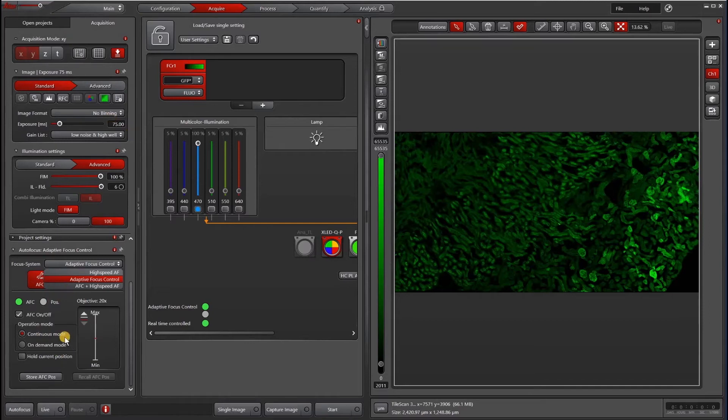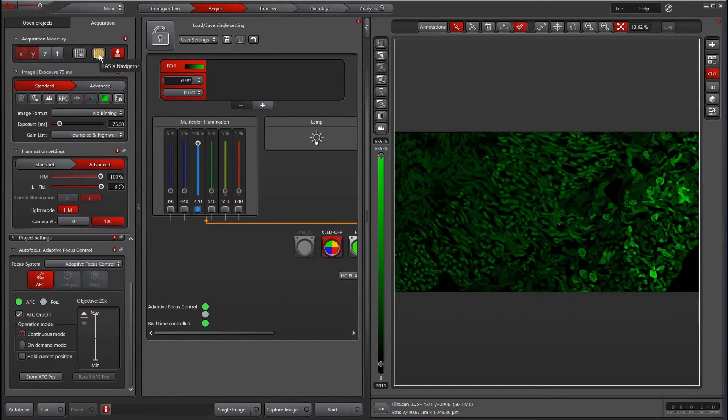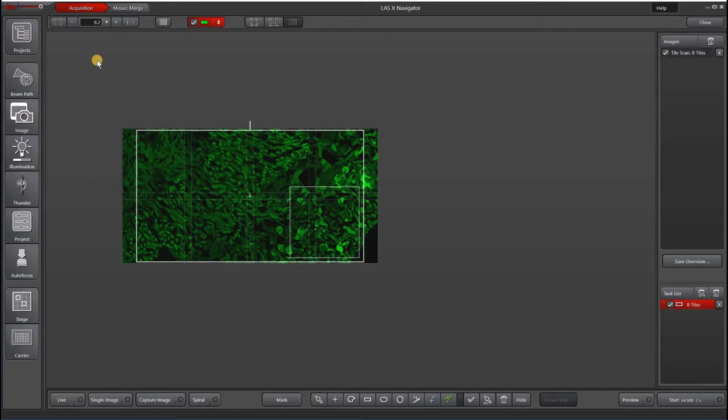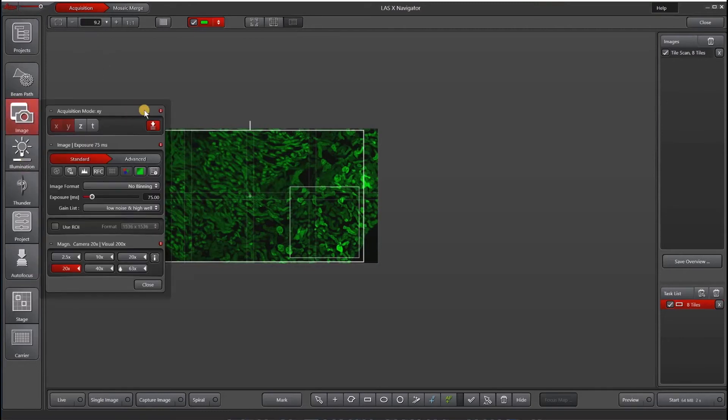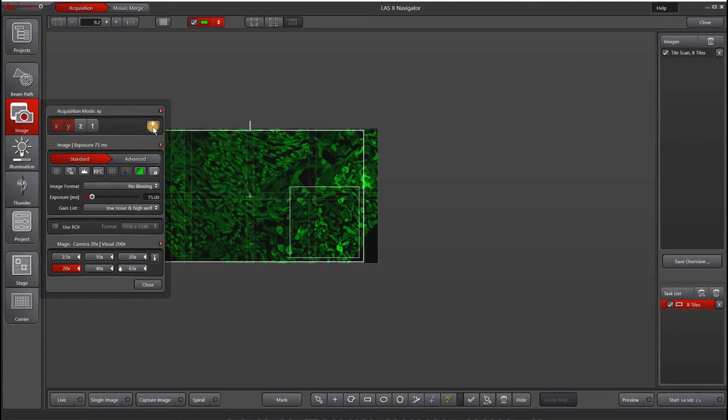In order to access this panel in Navigator, first of all, let's launch Navigator. To launch the autofocus panel, I actually have to go to image here and select this show autofocus.